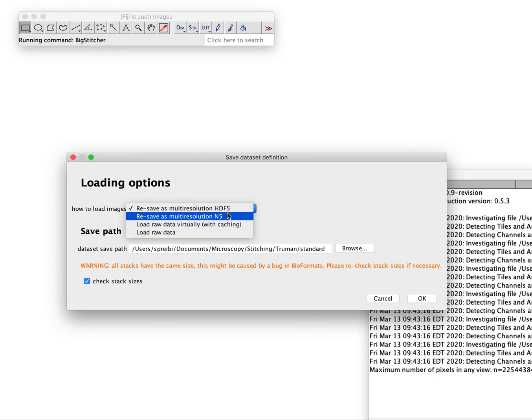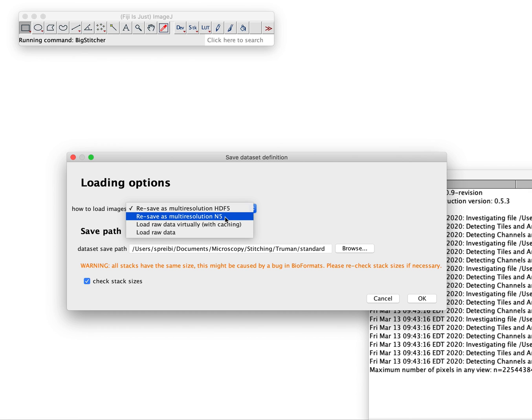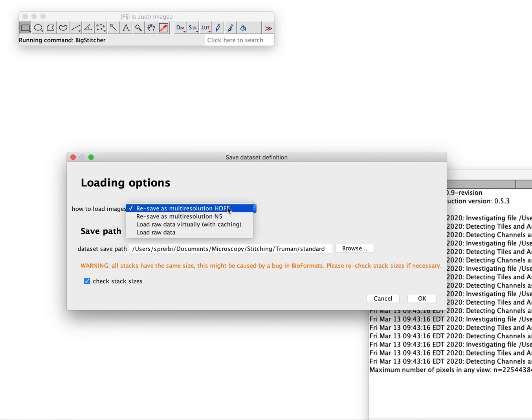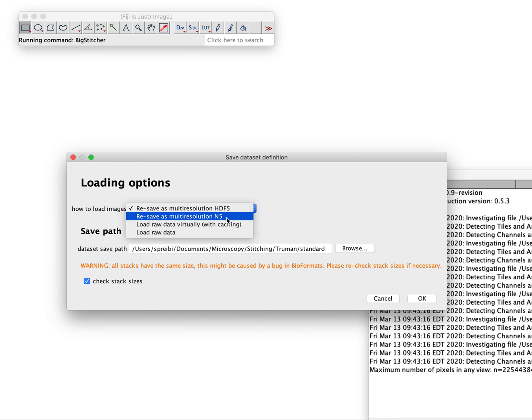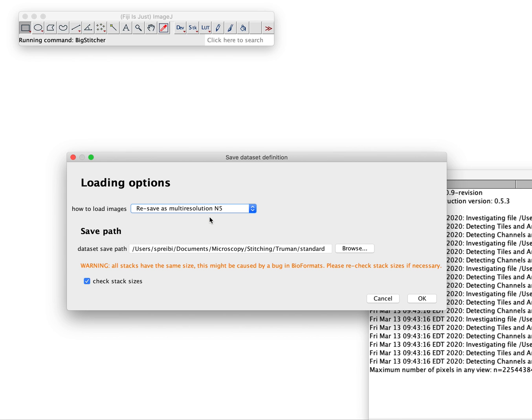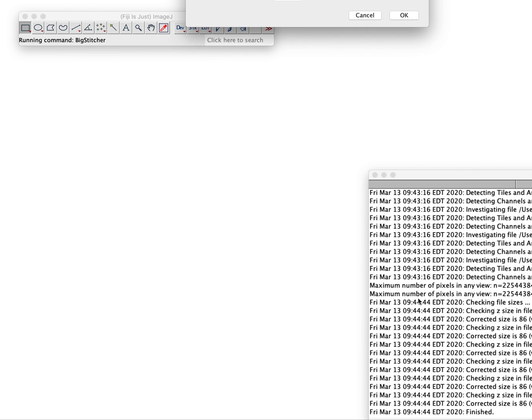This one really doesn't make sense, it might be for some cases, but if you actually want to work with the data you want to use HDF5, N5, or with caching if it's very small. In this case I suggest to use N5. However, I didn't make it the default because HDF5 has been used for many years now and we know it works. N5 I just added, there could be some bugs. I don't hope so but that's why it's not the default as of yet.